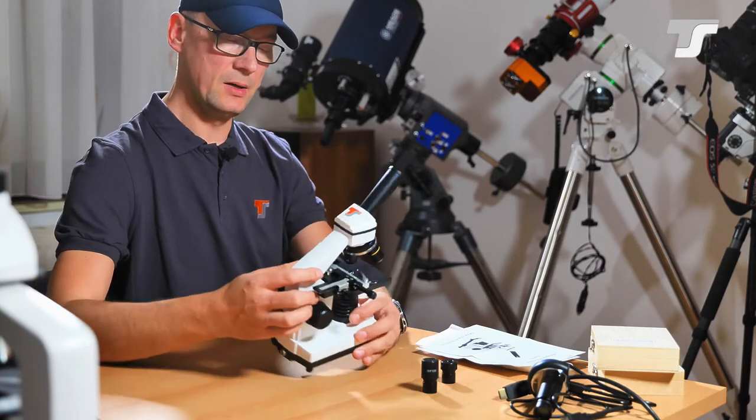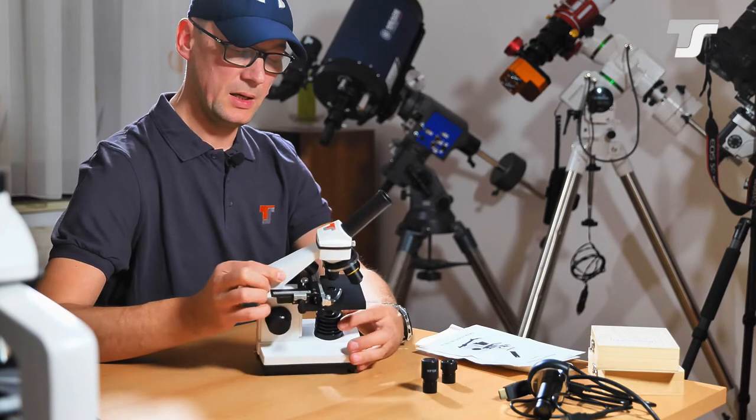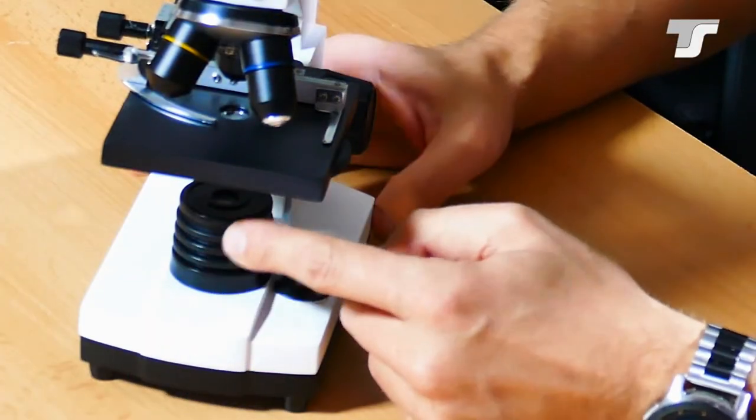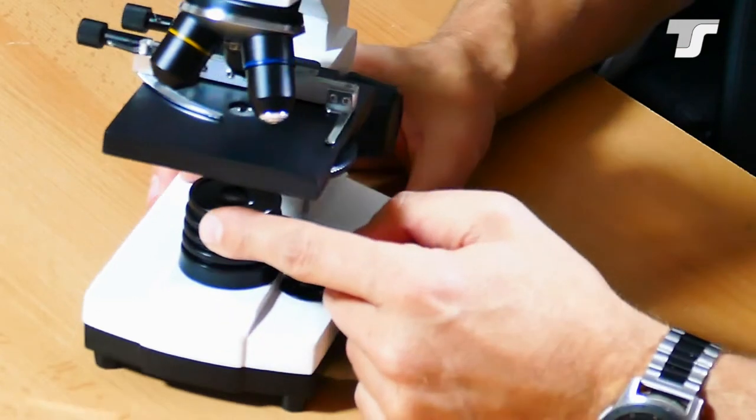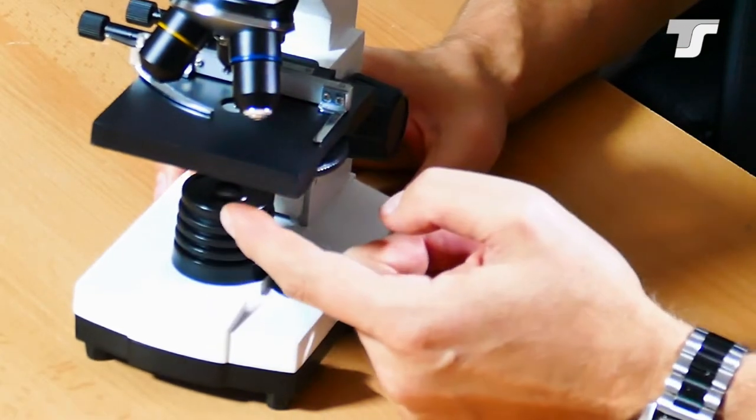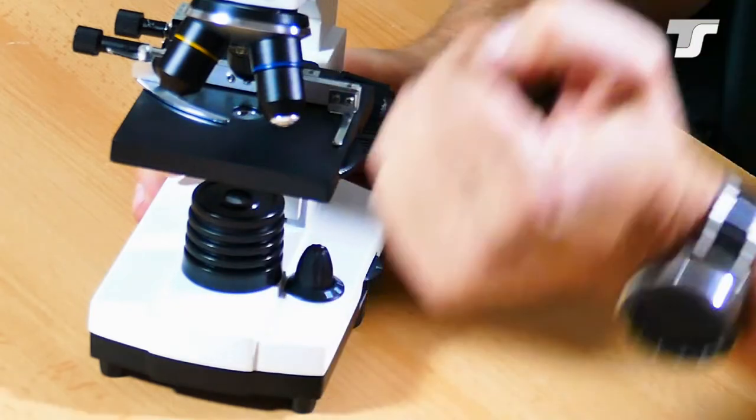So far this is the top. Now let's get down to the bottom. Here we have a condenser lens and the integrated LED. This is used for transmitted light. It will focus the light a bit through your subject.